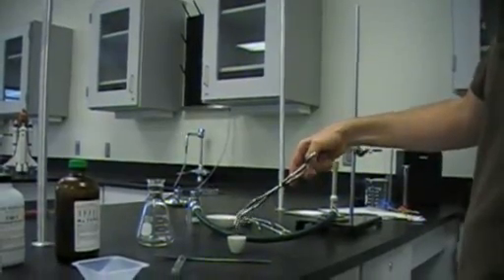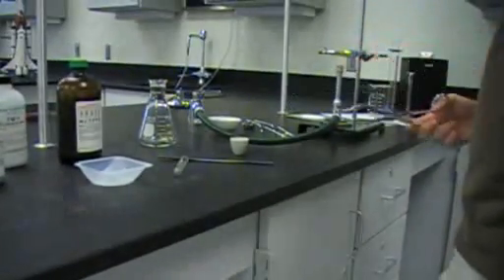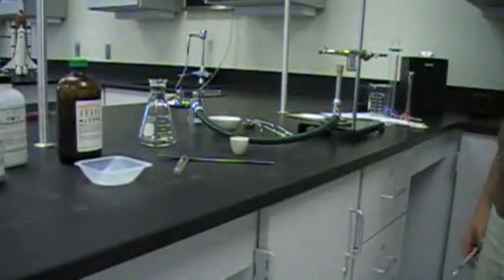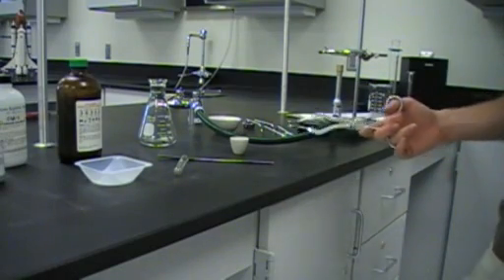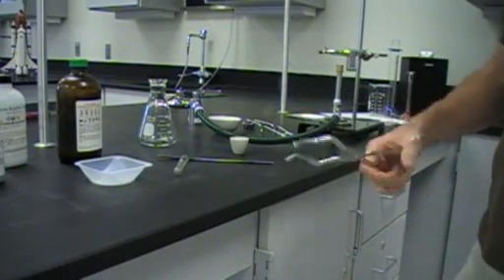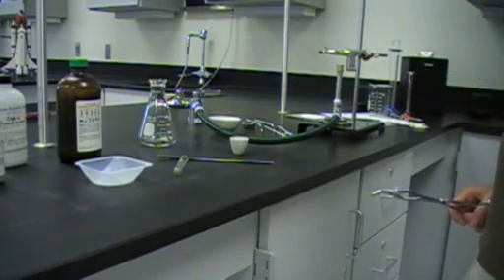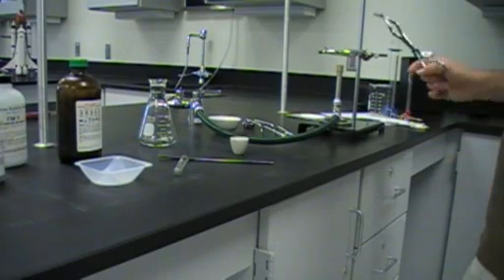You can grab the crucible and safely set it on the counter. As you notice, I just set it directly on the counter. It is burning hot. But these counters are designed to be heat resistant. And it is fine just to set the crucible on top. So again, crucible tongs.